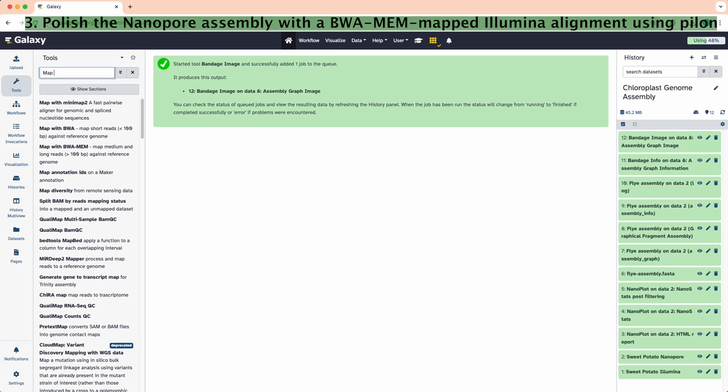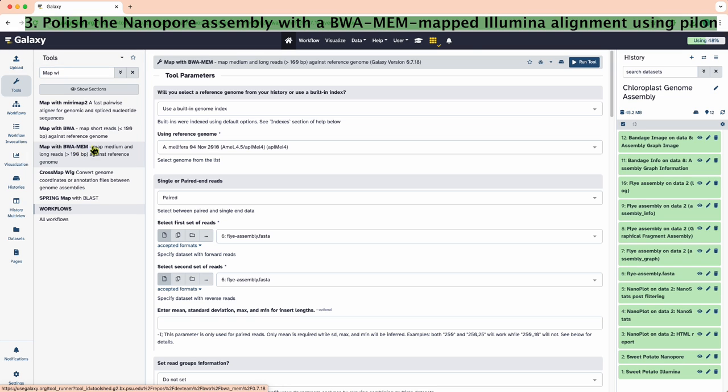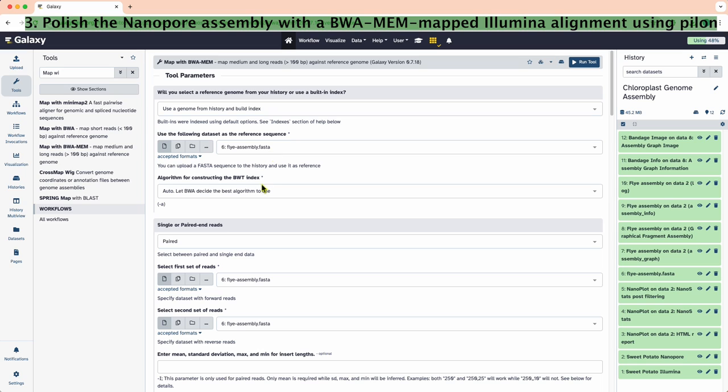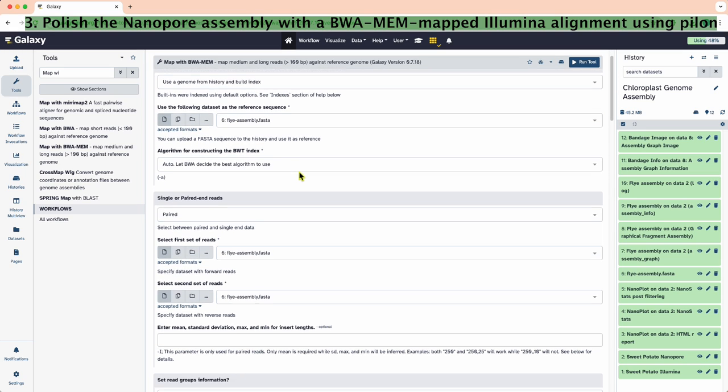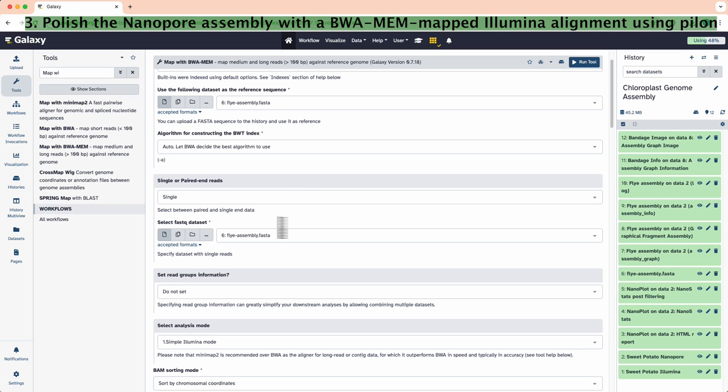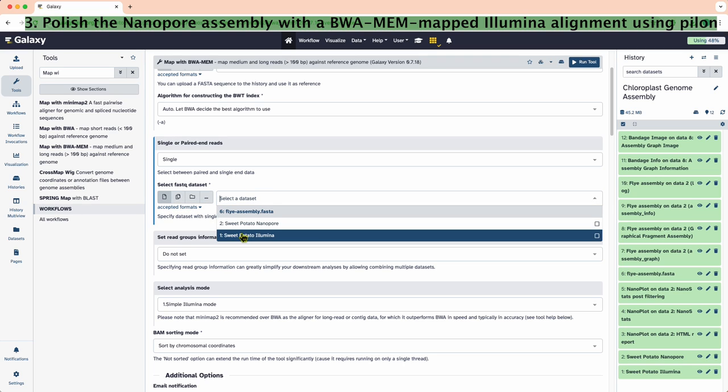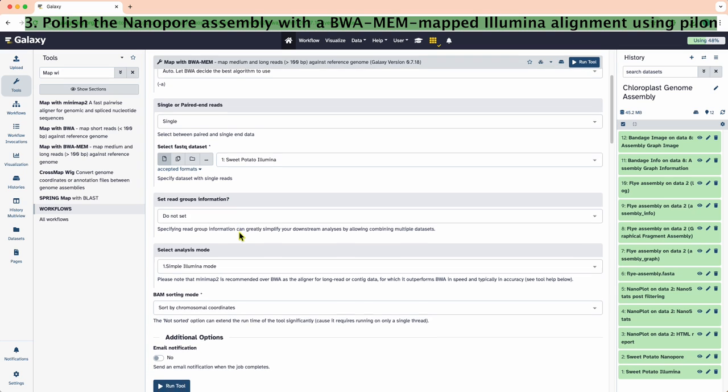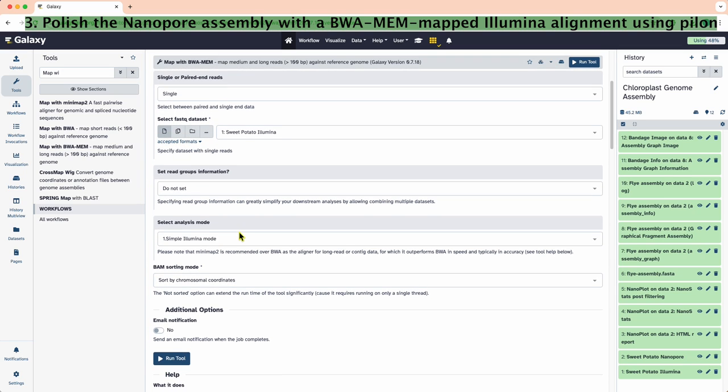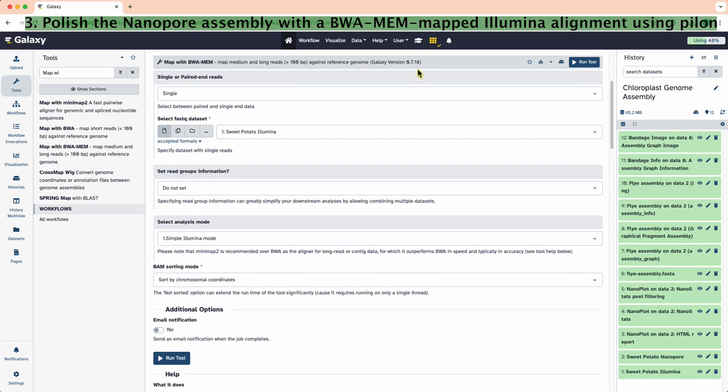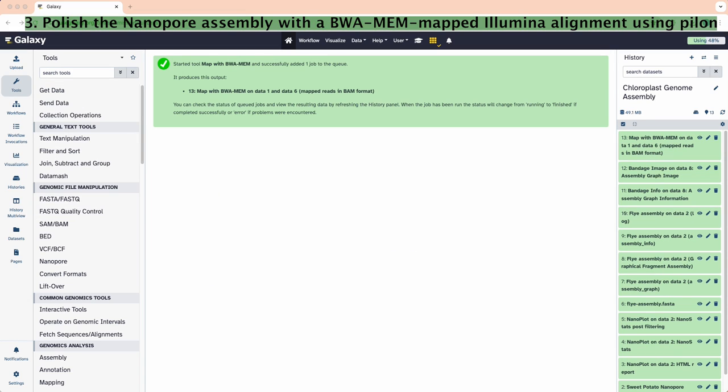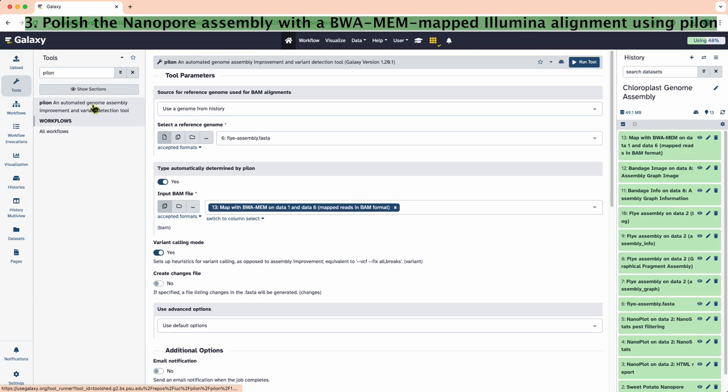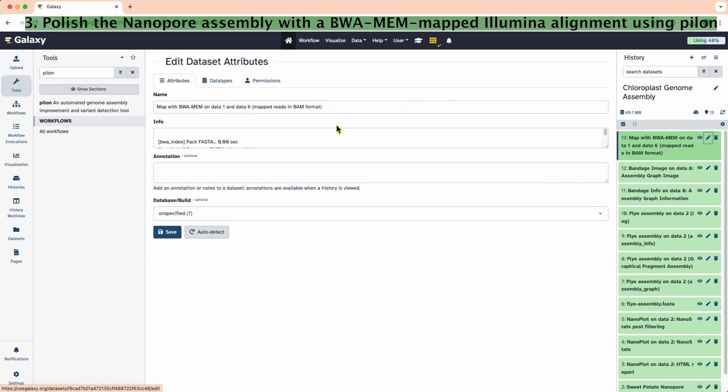We will use the shorter but more accurate Illumina reads to correct sequencing errors in the nanopore assembly. Let's first map the Illumina reads using BWA-MEM. Here, we will use the assembly fasta file as a reference. We will let BWA decide algorithm for constructing the BWT index. It is single end, the data is Illumina, no read groups, and we are using the simple Illumina mode. Rename the BWA-MEM output file as illumina.bam.